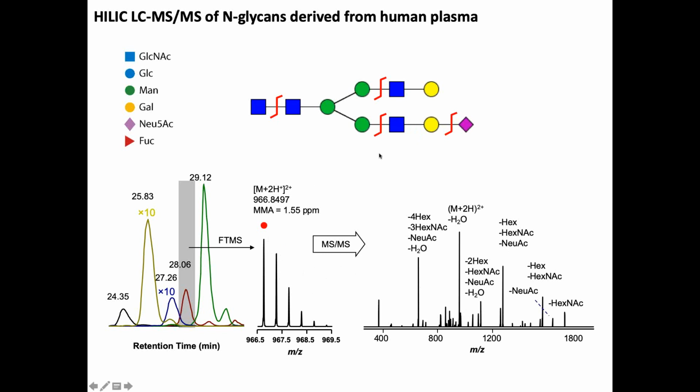And from this standpoint, this sialic acid could be here or here. That's one of the issues: there is really important biological information that I don't believe this data could give you right now. These could be biologically significant stereoisomers and things of that sort. They're tricky to tease out.